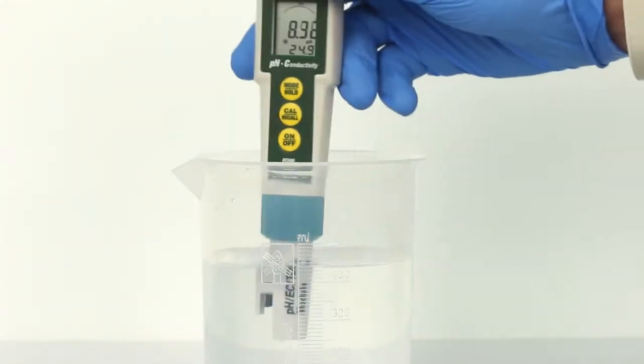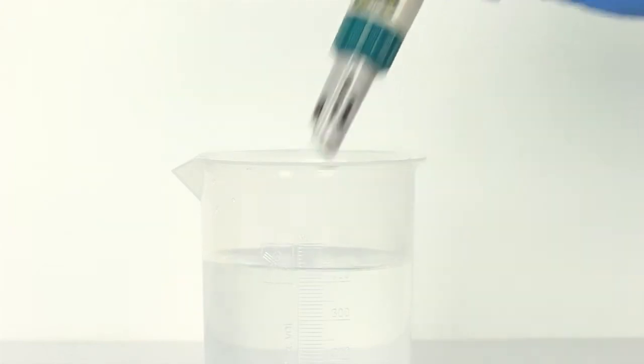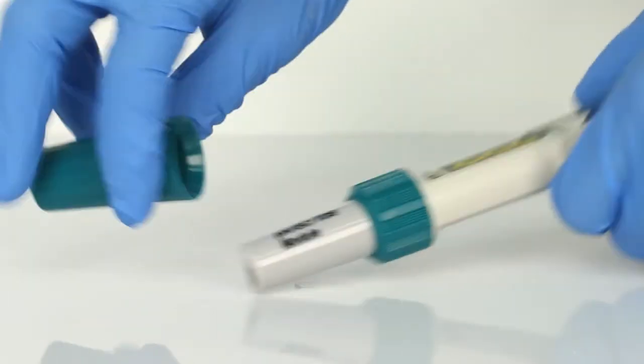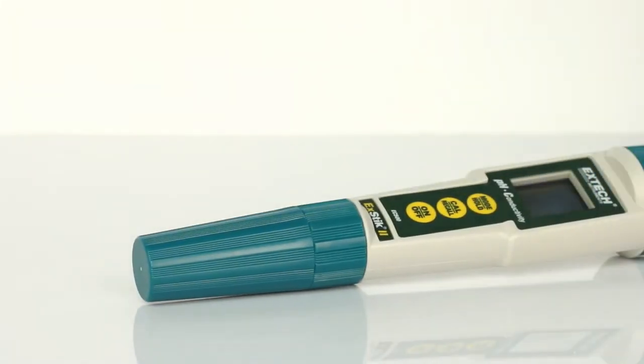For two- or three-point calibration, rinse the electrode and repeat the steps with the remaining pH buffers. To preserve the pH electrode life, keep the sponge in the protective cap soaked with pH 4 buffer solution.